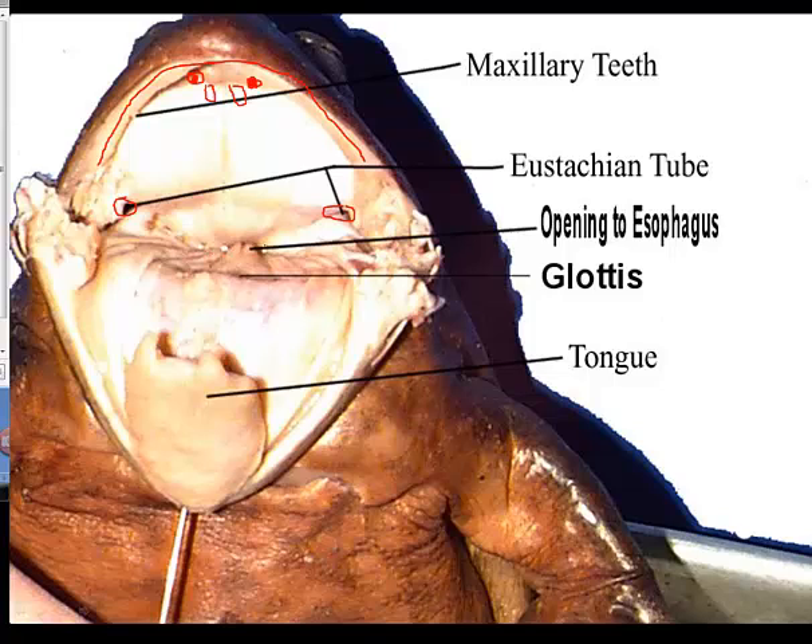In the back part of the mouth there's going to be the opening to the esophagus. This structure right here is the glottis. The glottis is a slit that allows air to travel from the mouth into the larynx, into the trachea, and then into the lungs. You can take your probe and split this — it's a slit that you can get the probe through — and that's going to open up into the trachea and into the lungs. Behind this, along the back part of the wall, you're going to see the opening to the esophagus.